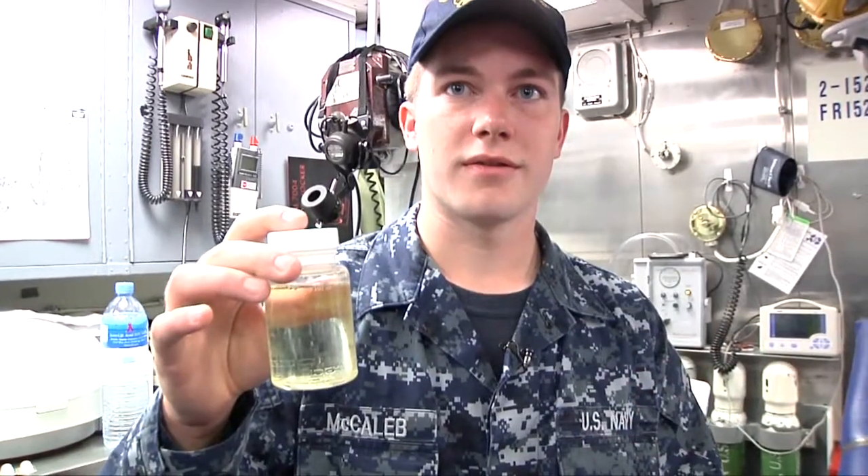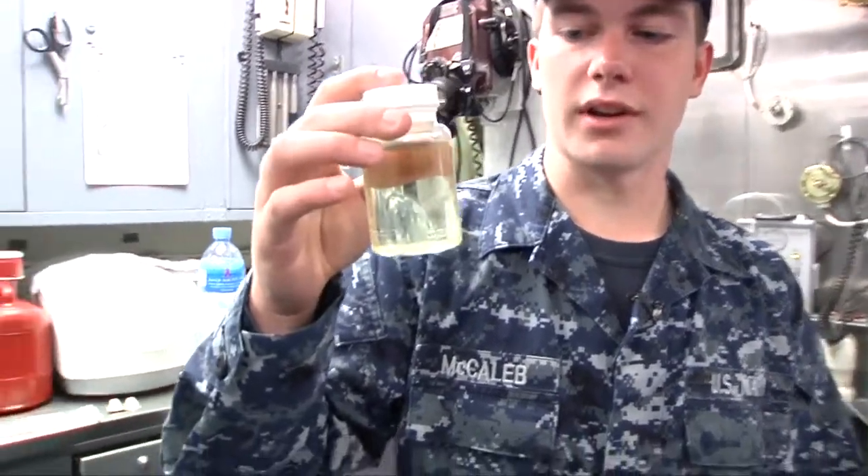This will be what a positive E. coli sample would look like. So that's the actual — is that E. coli? Yes, it has E. coli in there. Wow.